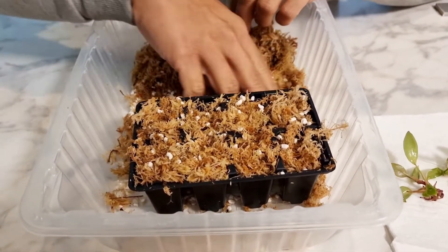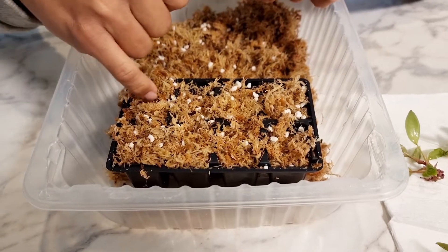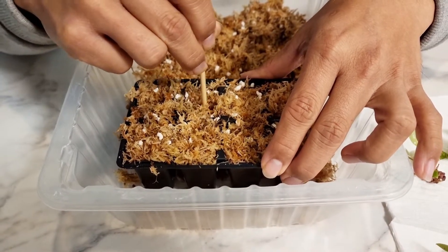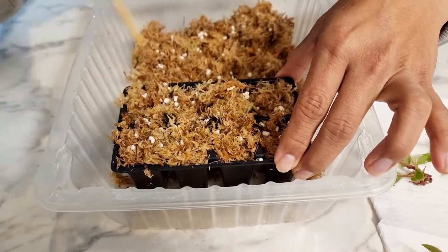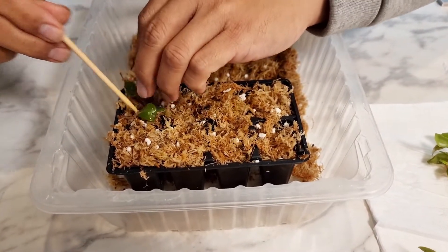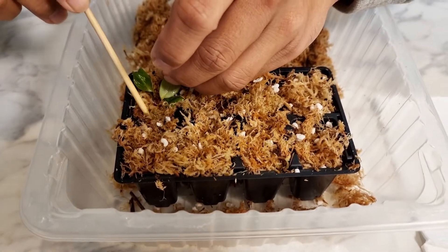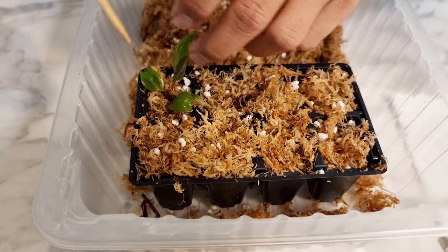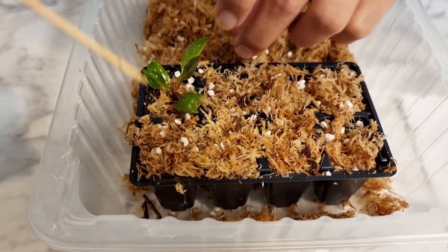Once the tray has been filled with media to the brim, we poke a hole in the middle for the plant to go in. You can use your finger or a small stick — a barbecue stick works. Try to get an estimated size for your plants. Once that's ready, take the plant and position it in the hole. Press the sides to hold the plant in position and make sure the roots are properly settled, intact, and covered with the media.